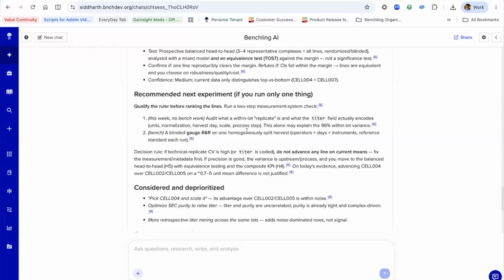And so this kind of work can help your team make sure you're on the right track with any kind of scientific data that you're going to produce next. And that highlights why the hypothesis generation skill can be really useful for your team. And so with that, I'll leave the further testing to your team. And if there are any questions, feel free to ask us out in the community.